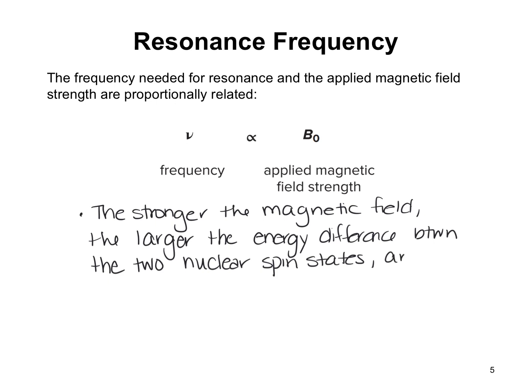And therefore, you need a higher frequency for resonance.